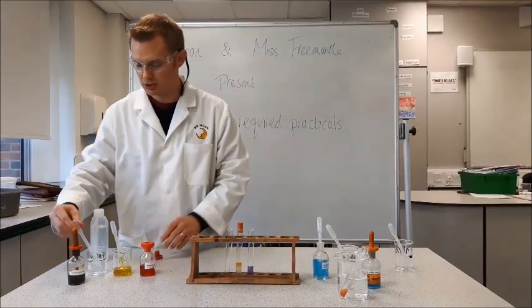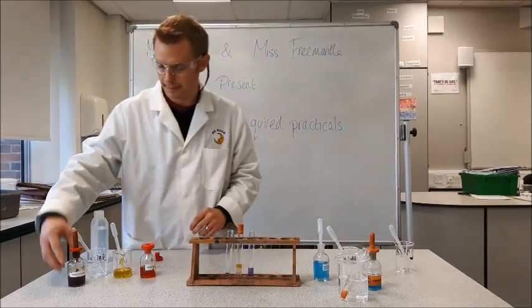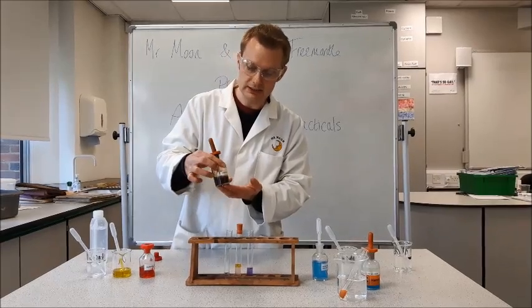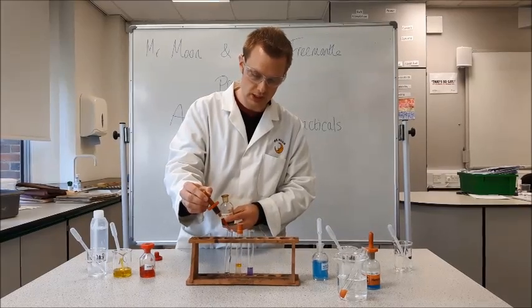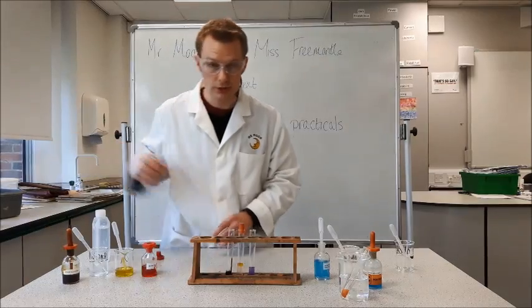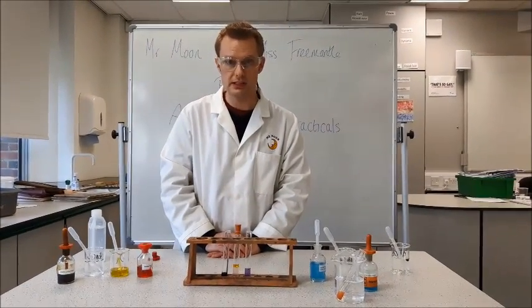The final test is for starch. I'm going to add a sample of starch to my test tube, and then a couple of drops of iodine. Iodine starts off a very brown colour, and as soon as it comes into contact with starch it will change to blue-black. Those are the reagents you need and the positive results for each test.